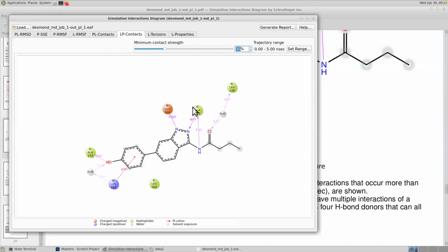Yeah. Any other questions? Yeah, if you have any other questions, let me know. This is very important. I guess probably all of you are new to this simulation, and if you are using the Schrodinger tool, it is not difficult to set up the calculation, right? You can easily set up the simulation and run the calculation. But how to interpret the result, again, that is very important.